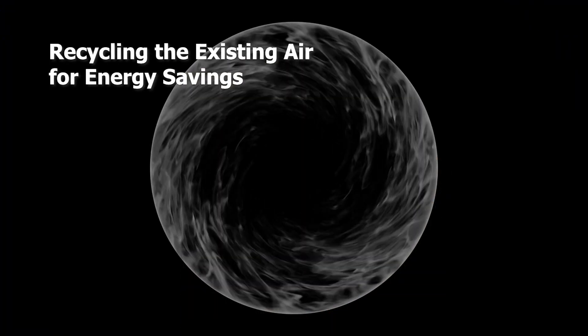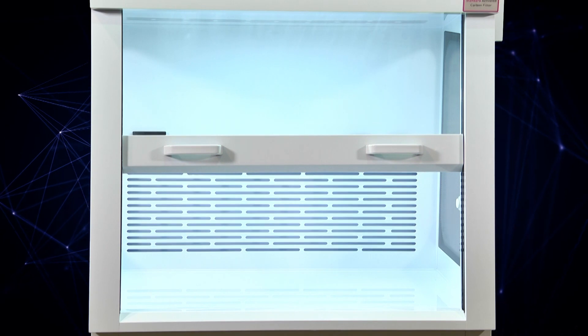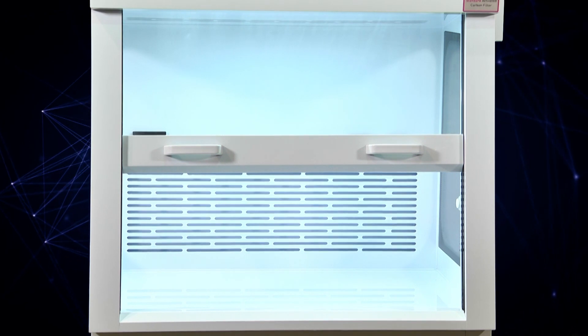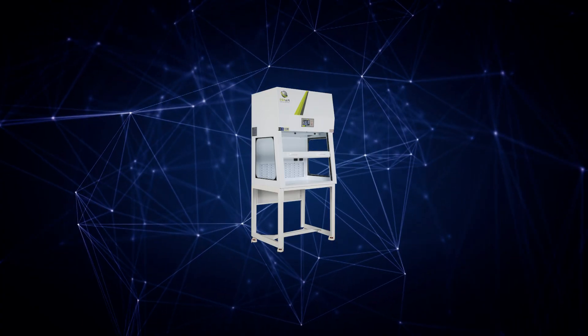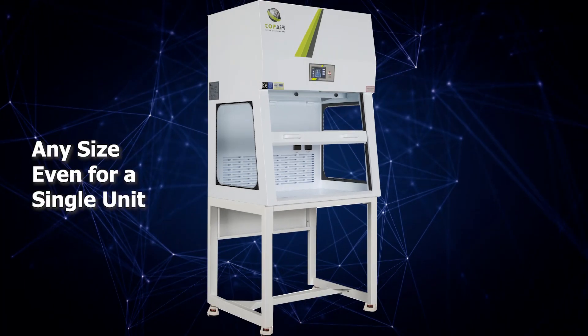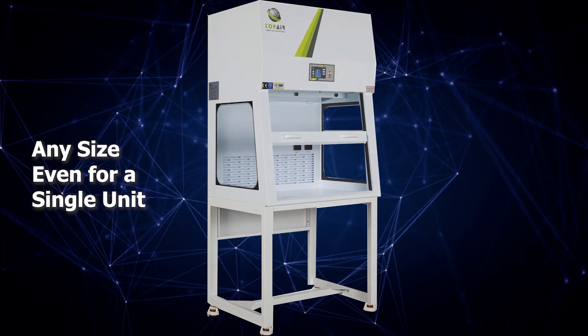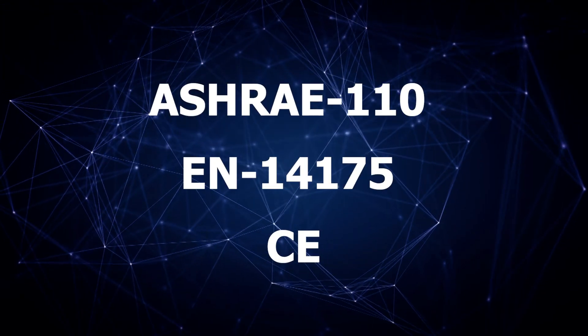Recycling the existing air retains the existing temperature to save power. The ductless fume hood features a welded corrosion-free polypropylene structure with a built-in sealed polypropylene worktop. In addition to 20 standard sizes, the hood can be customized to client needs and produced in any size, even for a single unit at a competitive price. The hood complies with all relevant standards.